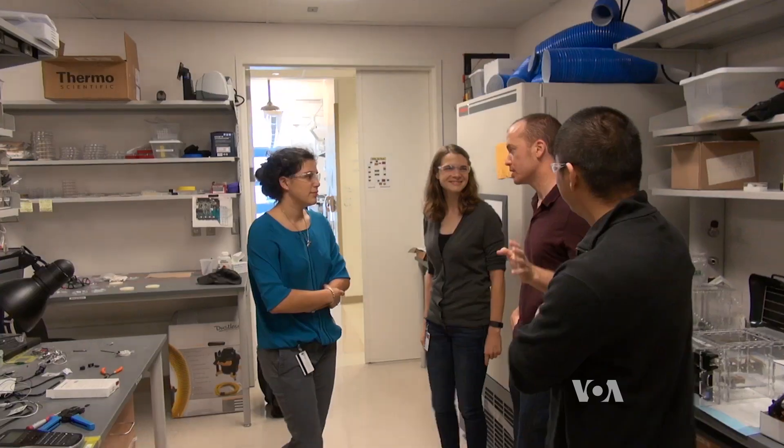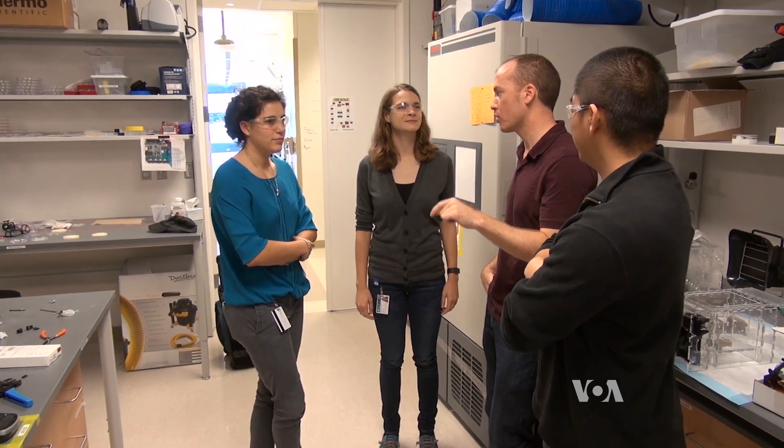But the ultimate goal, says lead researcher Jordan Miller, is to produce structures that can be implanted in humans. We're in the field that is trying to understand ways to build new tissues and new organ systems for human patients made from their own cells.